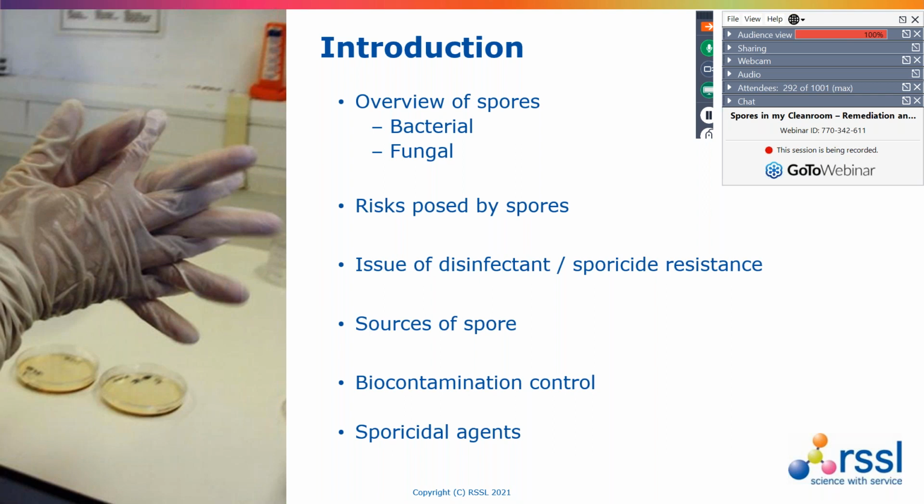Welcome everybody to the webinar. I'm going to talk for about 35-40 minutes, and then we can take questions and answers. The subject of this webinar is all about spores, and we're going to be having a look at both bacterial and fungal spores. It's quite an important distinction to look at both of these types of spores, because they present different types of risks, particularly within the clean room environment.